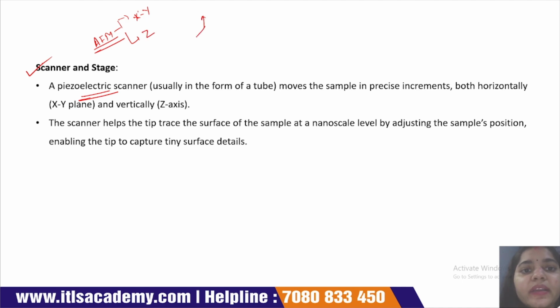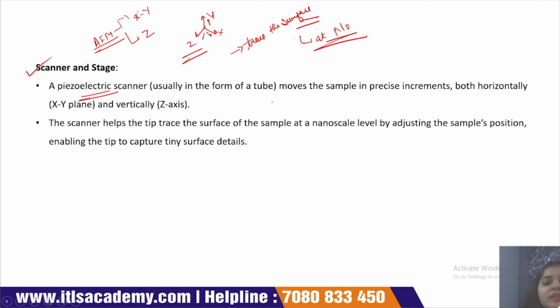This scanner can move in all three directions. This scanner helps to trace the surface of the biological sample at the nanoscale. This is the working of AFM.